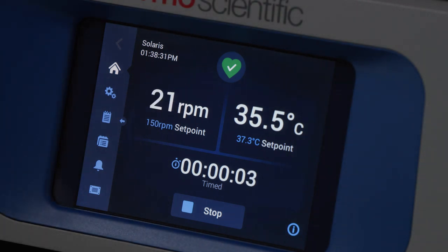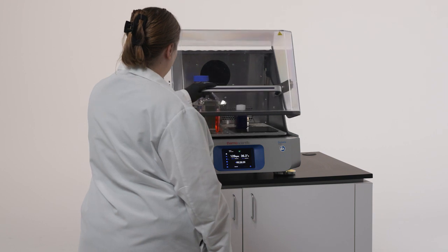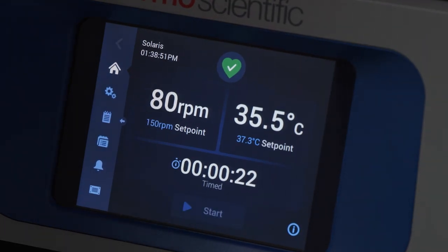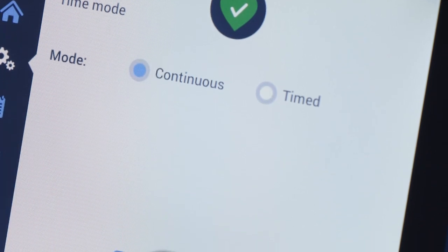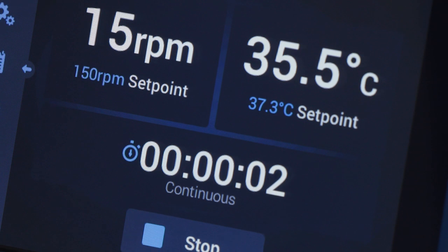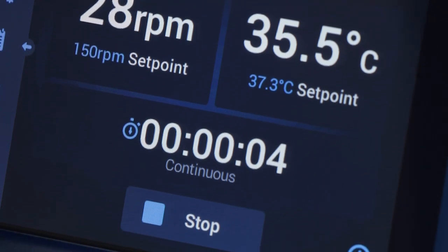The shaker run can be paused or stopped by either lifting the lid or pressing stop on the display. You can also operate your shaker in continuous mode. In this operating mode, the shaker time will start at zero and run until the unit is stopped.